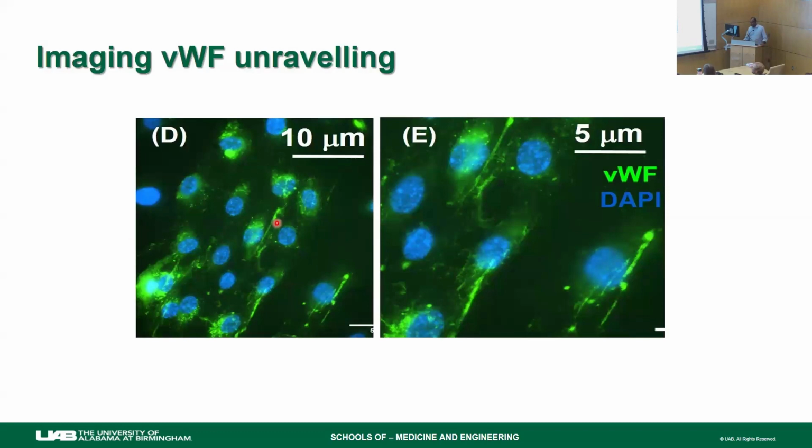We're actually trying to quantify the unraveling lengths on endothelial cells. The ones we did before were isolated von Willebrand factor, but this is looking at it at the surface of endothelial cells. We're working with Alexa Mathisis, who's the director of the high resolution imaging core, and we're able to subject these cells to pulsatile flow, continuous flow, and fix these cells while they're under flow.